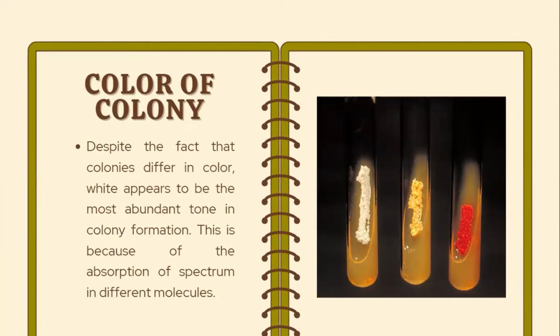Next, we have the color of colony. Although colonies differ in color, as you can see in the illustration, white appears to be the most abundant tone in colony formation. This is because of the absorption of spectrum in different molecules.